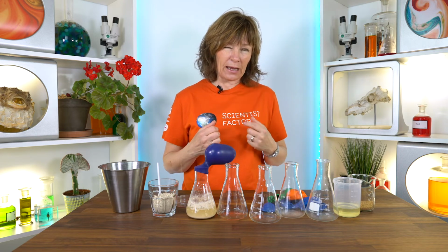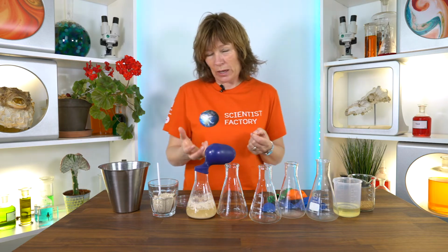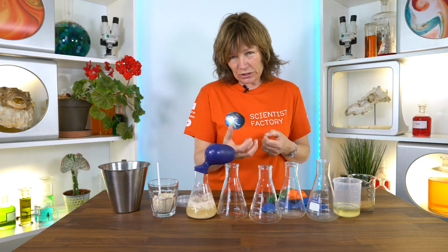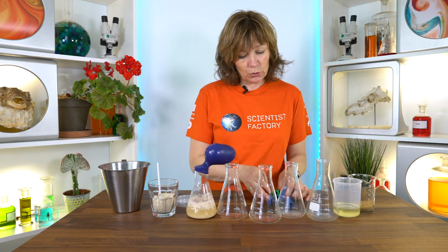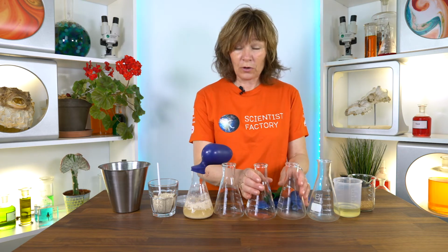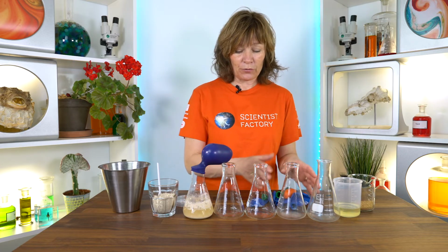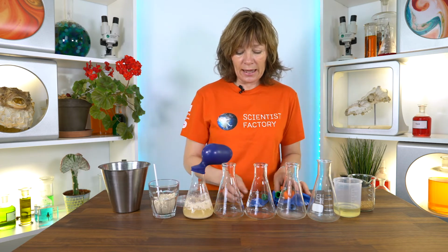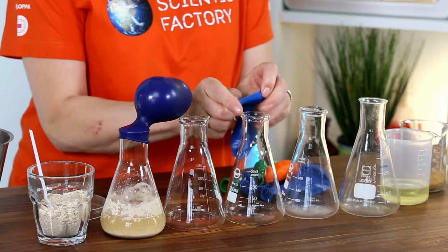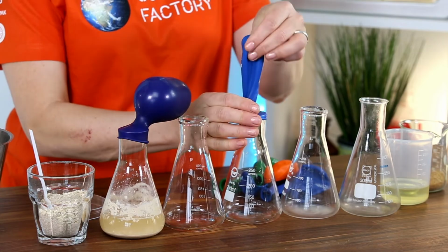And usually you will have to help your students start thinking this way, but start it as an open question and lead them on the way. And then you can show them the equipment you have ready. You have either bottles or flasks like I have here, and you can then set up different combinations with the mysterious substance in these flasks, and you just put a balloon on top, and if a gas is developed, it will be filled by gas.